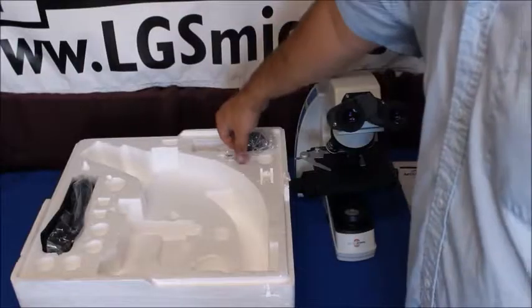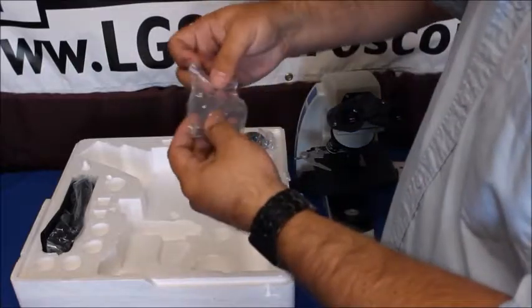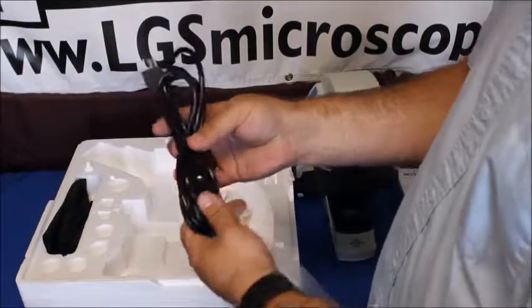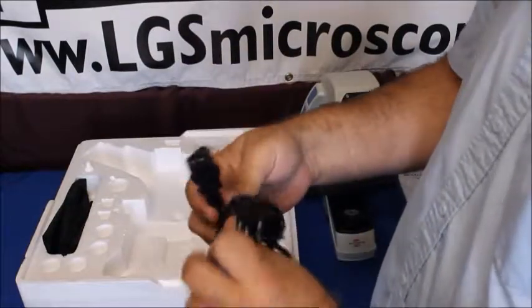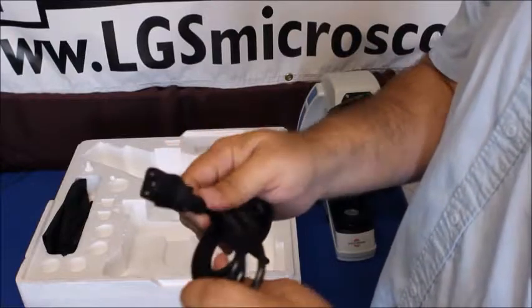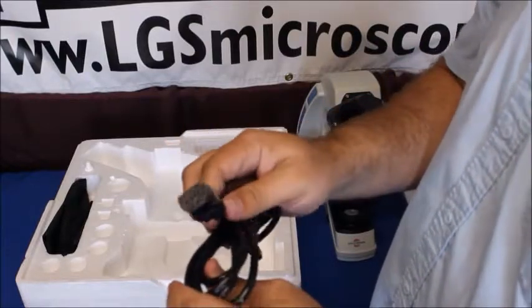Okay, we've got a few other goodies in here. These are some tools. We'll get into those later. This is your power cord. Standard power cord connection. You might see these on computers or monitors or most electronics have this same power cord.